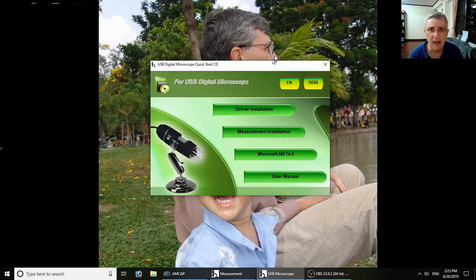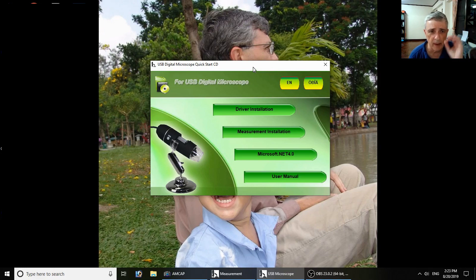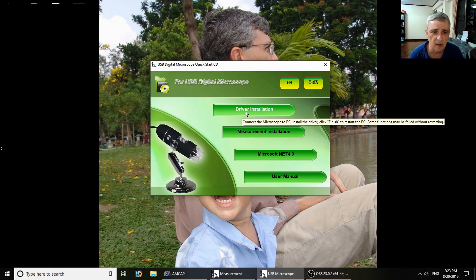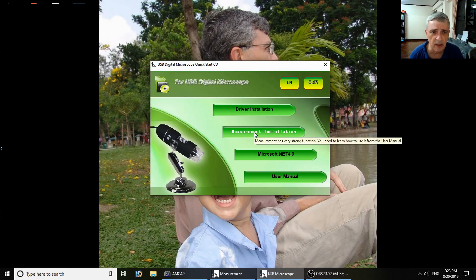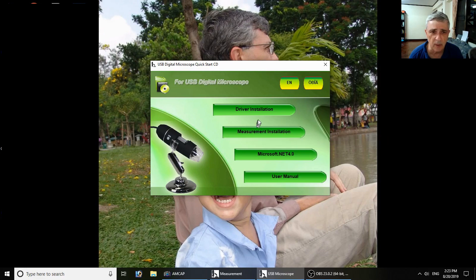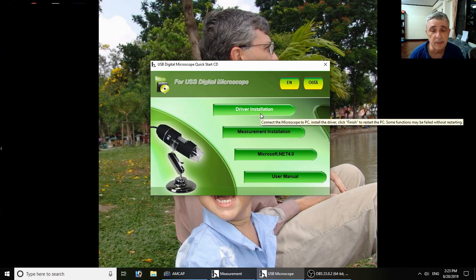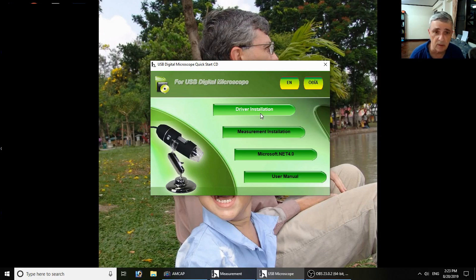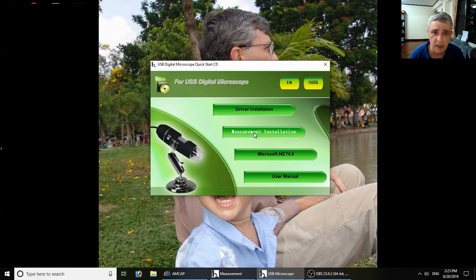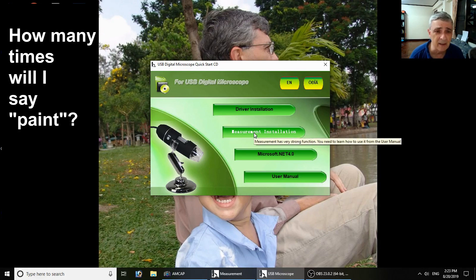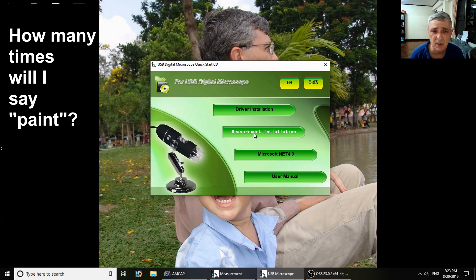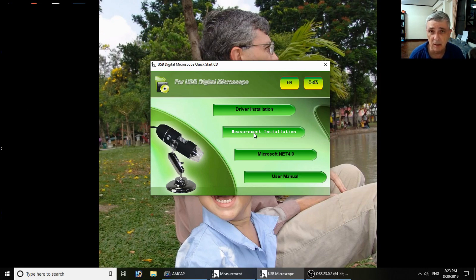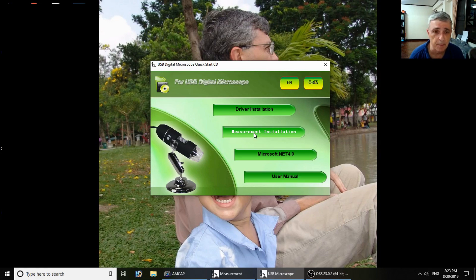The first thing you have to do is use their little supplied DVD - it's got a tiny micro DVD. You install these first two things: the driver and the measurement software. The driver obviously runs the microscope, and the measurement is a lot like Microsoft Paint except it allows you to manipulate the image and make measurements on the image and keep those.